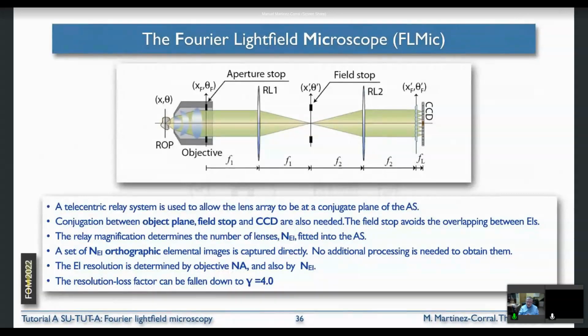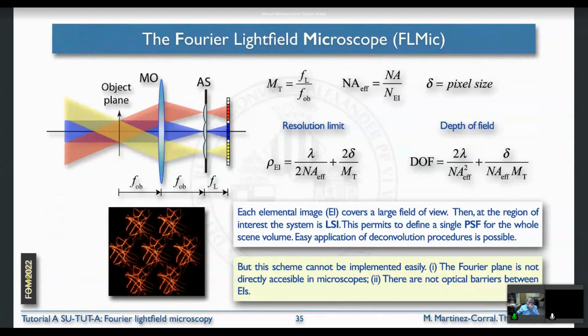Let me tell you that in order to have enough images to make the depth rendering, we need to have at least 3, like in the scheme I showed you before. We need to have at least 3 images. I think some authors have tried with only 2. So, okay, 3 along a line and 7. Some authors have tried fitting only 3, 1, 2, 3. But okay, I have not made this. So for the moment, I will always try to fit at least 3.